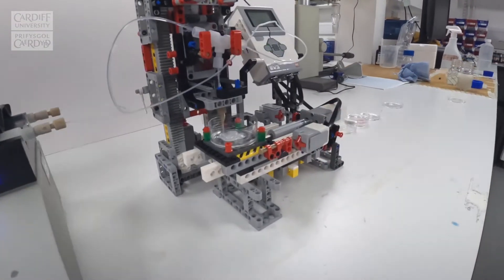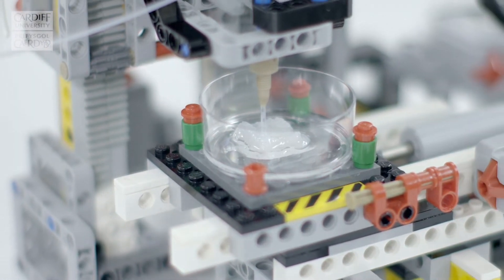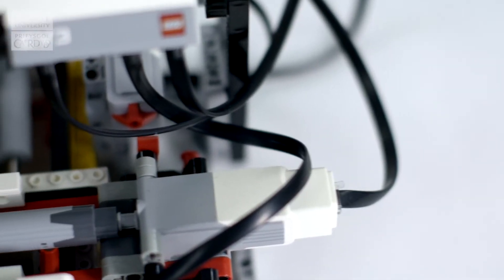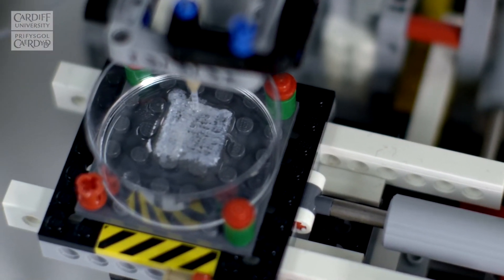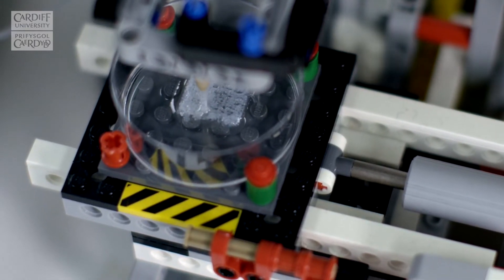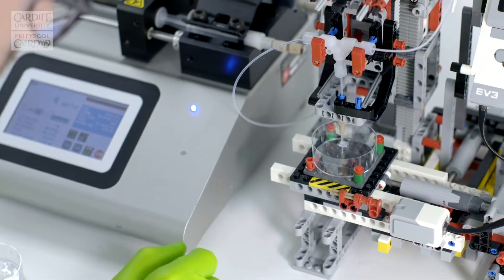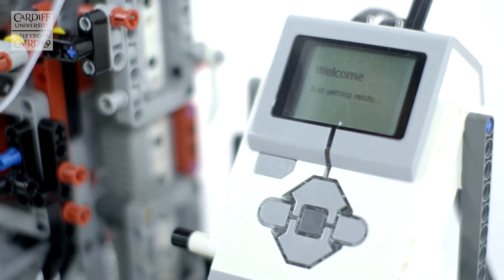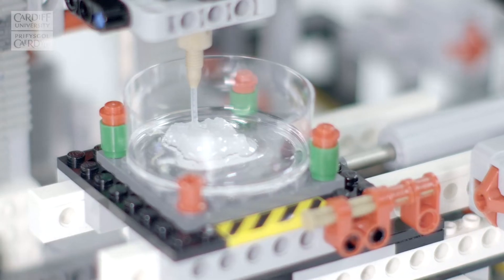If I take you to this small plastic dish, you'll see a steady flow of droplets coming out of the nozzle, and each of those droplets is a gel-like substance which contains a host of different cells. Ahmed and a number of other talented researchers and students have developed a range of different patterns that we're able to use. The important finding for us is that we can get the resolution that we need using this simple, low-cost equipment in order to build tissues that are potentially extremely complex.